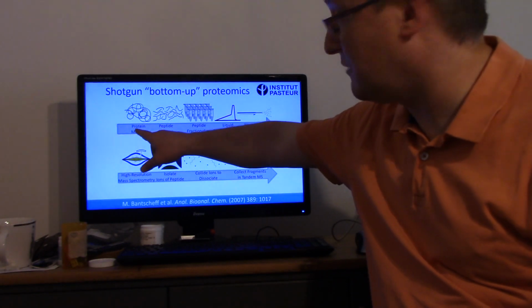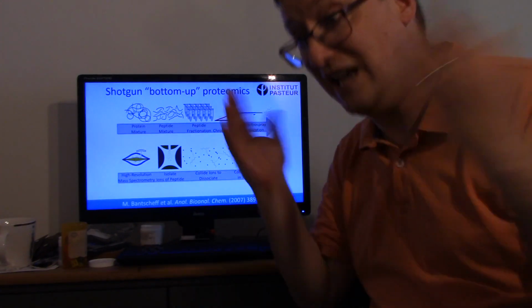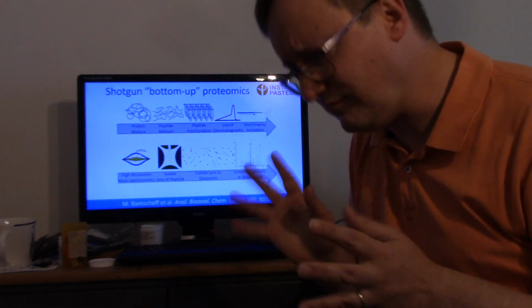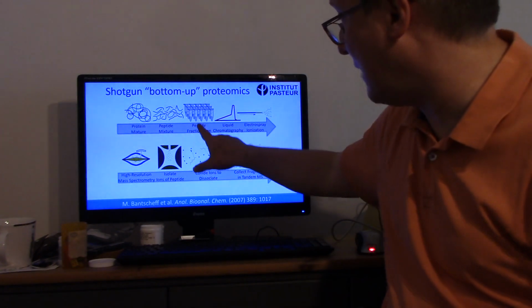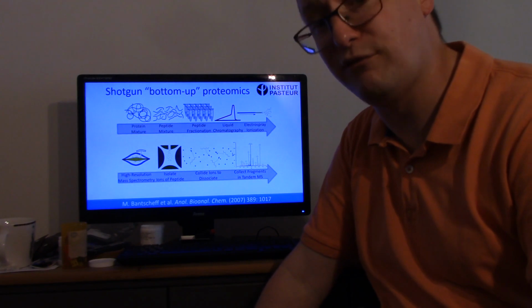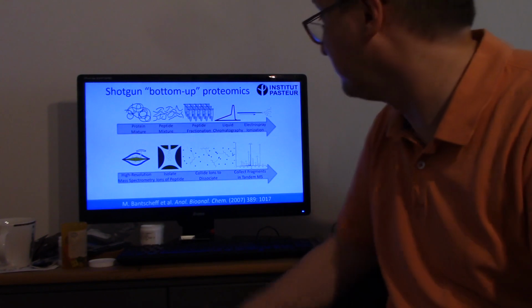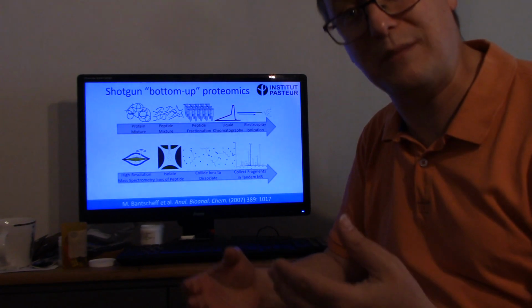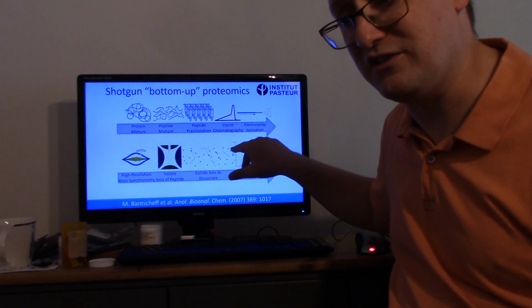So having made a protein mixture more complex by digesting it, we may then separate that very highly complex mixture, 100,000 peptides or more, into different fractions. This can be carried out a number of different ways. This lecture is not about that. However, an individual fraction can then be separated over time by the hydrophobicity at which peptides elute from reverse phase liquid chromatography. Reverse phase liquid chromatography is a very widely used method for doing this separation upstream of the mass spectrometer.